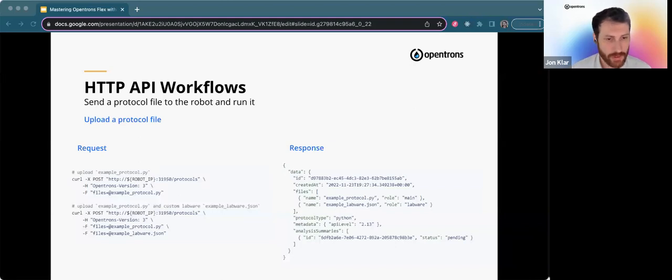I will go over the structure of a request real quick for anyone who's not fully familiar with it. The curl -X is just part of curl. This is telling it to use this utility. So the first thing you'll see is POST in all caps. There are several types of HTTP requests. I believe all of our endpoints use either GET or POST. GET essentially means that you are asking for information. These are standard ways of formatting requests, and POST means you're giving it a command to do something or you want to make a change to it.